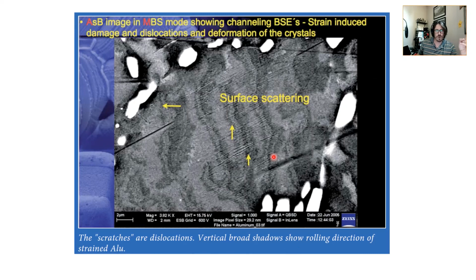Again, they're saying this is dislocations again. The scale bar is even bigger, so I don't think this is correct in that they're saying these are dislocations. It's some other feature. I do not believe this is dislocations, and I'll show you when we start looking at TEM. Dislocations are very small. They're not on this order of magnification. So that's one thing. And again, no disrespect to Zeiss or Heiner Jacques. I just have to patently disagree that these are dislocations.